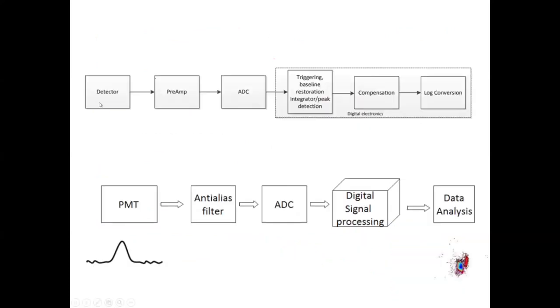So the detector, basically what it does, as I told you, the photons will be converted to electrons, right? The electrons will be filtered, and all the analog values will be converted to digital values. So analog to digital conversion, and there is something called digital signal processing. The digital signals will be processed, and finally data in numbers will be generated. And as I said, everything will be shown on a dot plot with a dot, which is the signal from every cell, right?